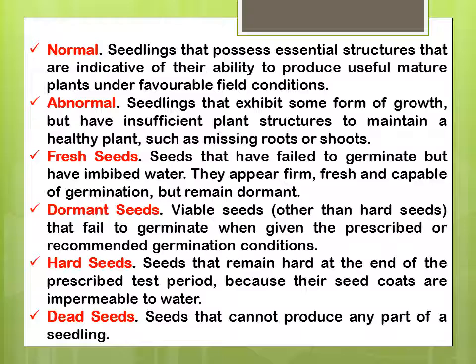Sometimes your seed lots are abnormal after testing, due to insufficient plant structure to maintain a healthy plant, such as missing roots or shoots. Sometimes you have fresh seeds. Fresh seeds means seeds have failed to germinate but have imbibed water.